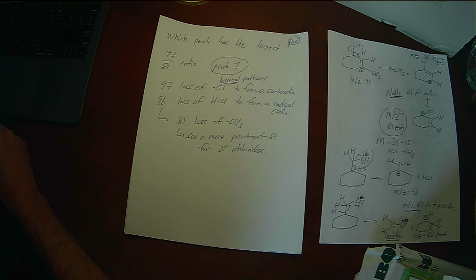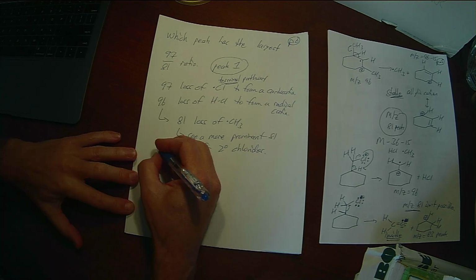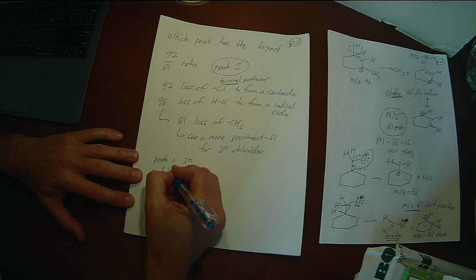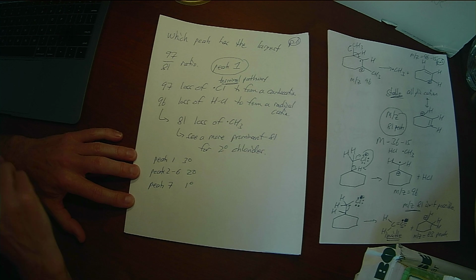The tertiary? Yep. So again, it's consistent, right? The shortest retention time is also consistent, not only with the larger 97/81 ratio and the prominent loss of Cl radical, but also with what the lowest boiling point would predict. So now you know which peaks are which, right? Peak 1, that's tertiary. Peaks 2 through 6 are all secondary. Peak 7 is primary. What are we going to do with that data?